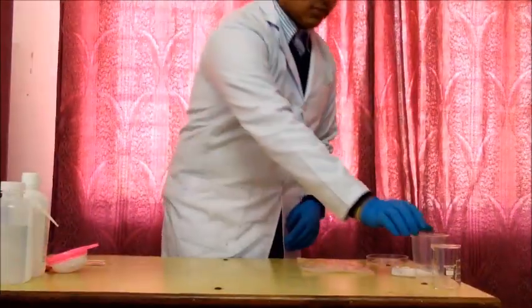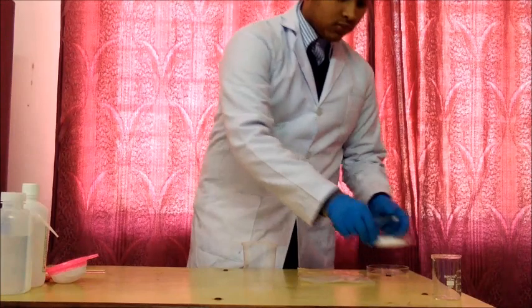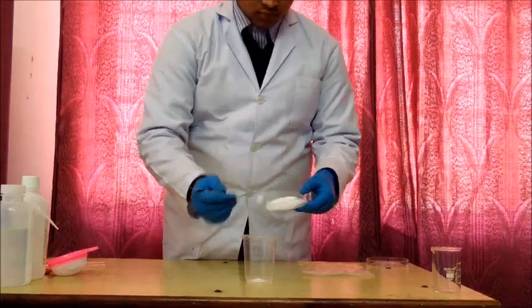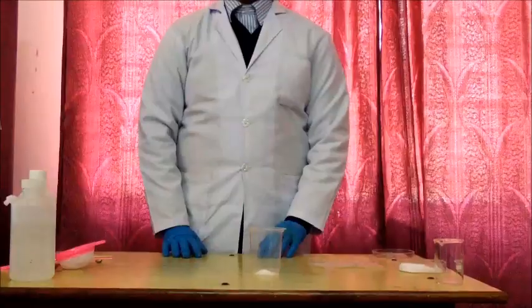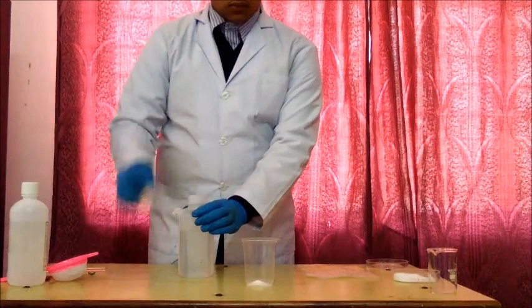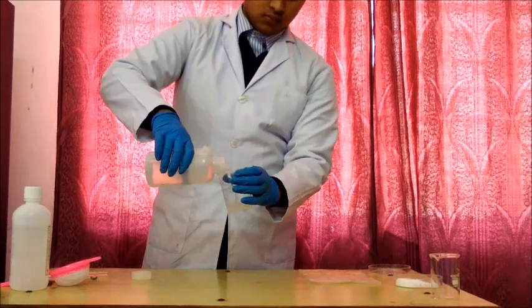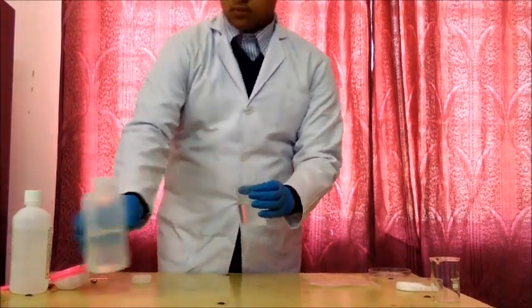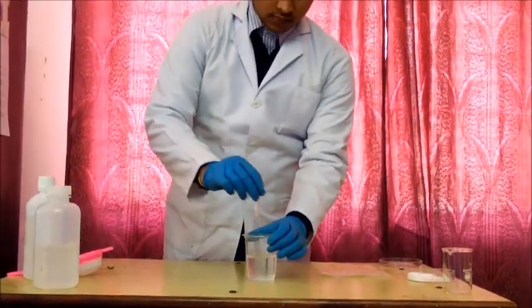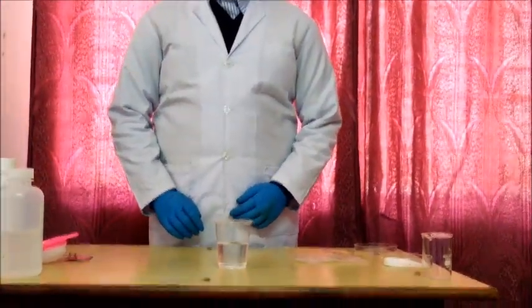Now we have to take a clear glass and add 2 teaspoons of common salt using the spatula — this is the first spoon, this is the second teaspoon. After adding the salt, we take the distilled water and pour half a cup. Now we stir the solution very gently. The solution we have is the salt solution.